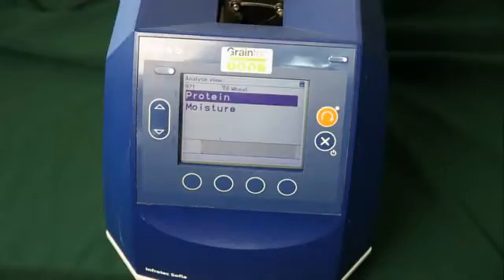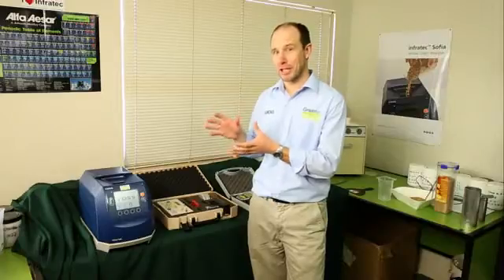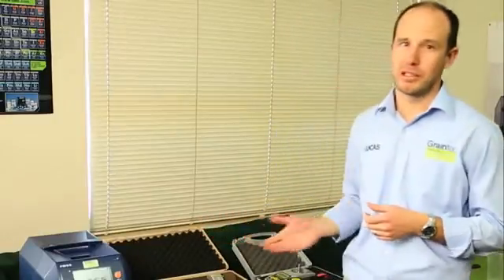The FOS SOFIA on-farm analyzer uses the same calibration technology as the FOS Infratec used at the depot. If you're not sure which moisture meter is right for you, please give us a call. We'd love to talk to you about which moisture meter is right for you.